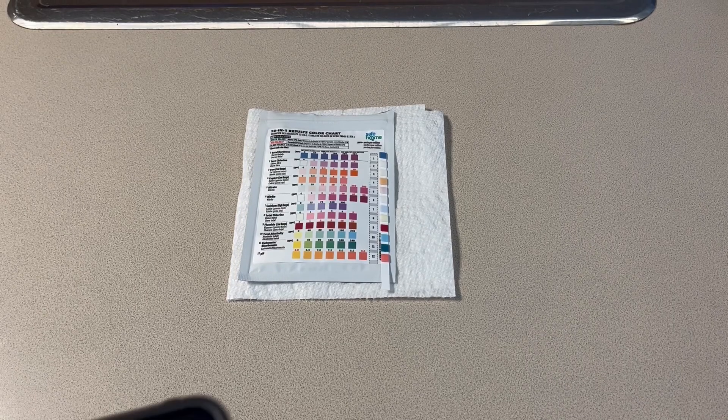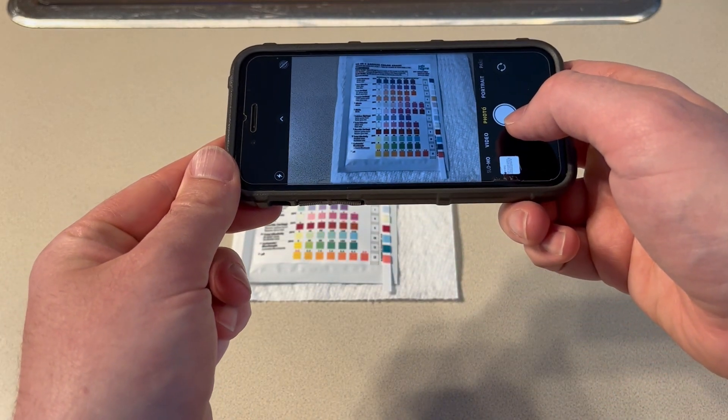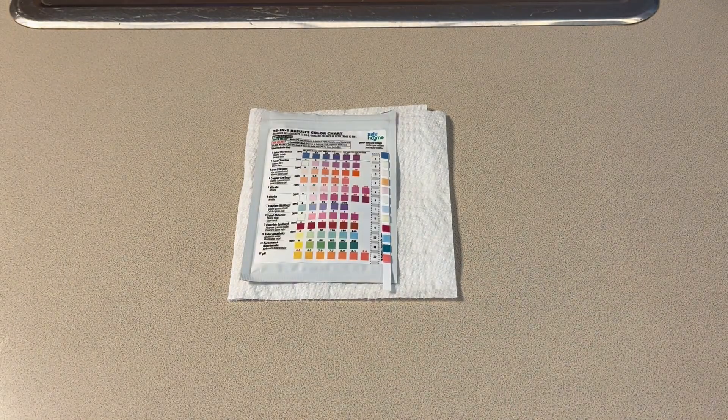We suggest you take a photo of your test strip and the color chart so you have a digital record of your results. Plus, if you have any questions, you can just send us the image and we can help you interpret your results.